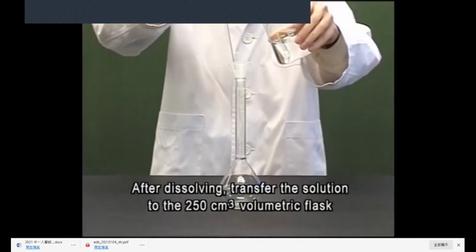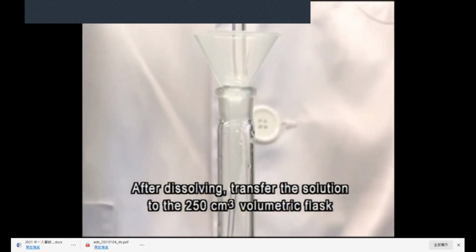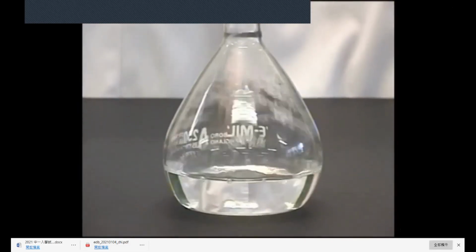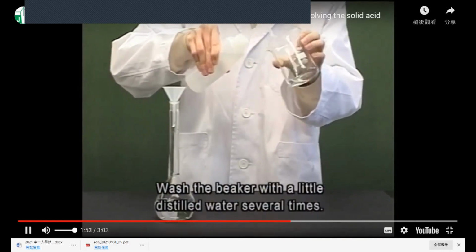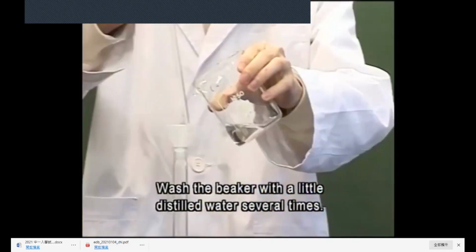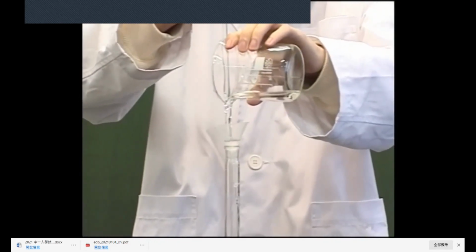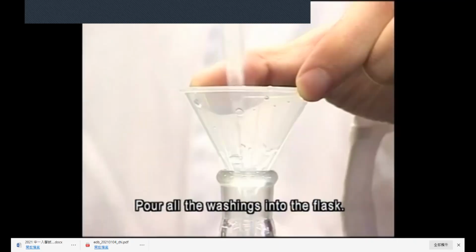After dissolving, transfer the solution to the 250 cubic centimeter volumetric flask with the aid of a filter funnel. Wash the beaker with a little distilled water several times. Pour all the washings into the flask. Wash the glass rod and funnel in the same way. Pour all the washings into the flask.